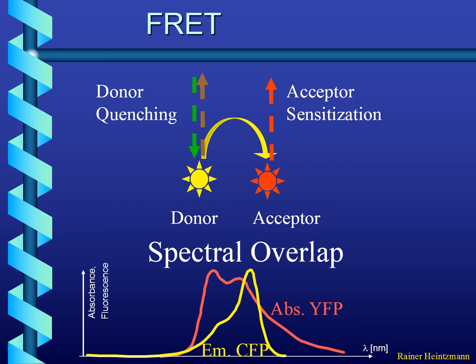At first glance, this looks like a process of the donor emitting some light and the acceptor absorbing the light. It turns out that this is really not the case, and it would not quantitatively describe what you're observing. Most easy to see is the polarization characteristics: the donor and acceptor would best re-emit and reabsorb the light if the two dipoles were parallel at a certain distance.